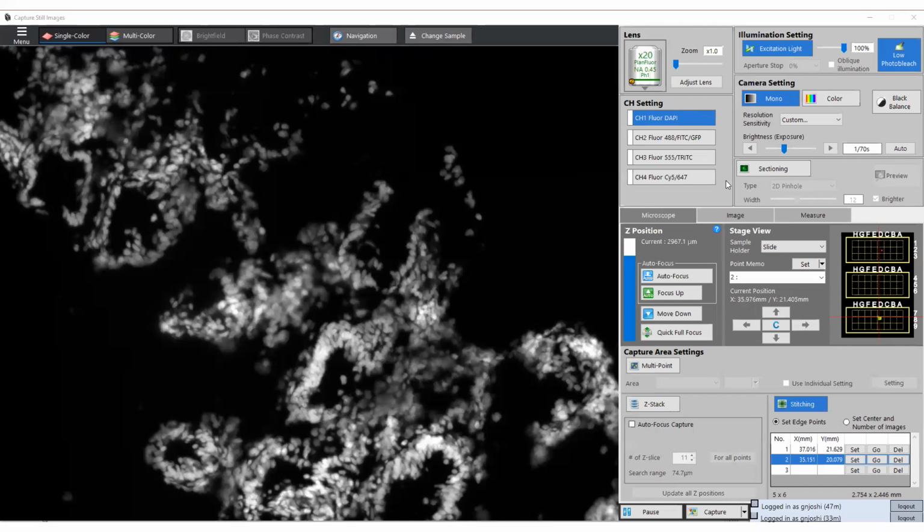But if you want to acquire multiple channels, you will hit multicolor, and that will give you the opportunity to acquire multiple channels. And I will talk about multiple colors when I show you the actual demo right now.